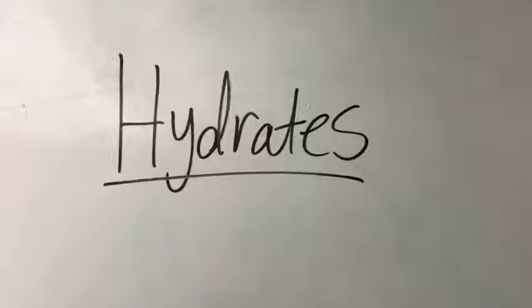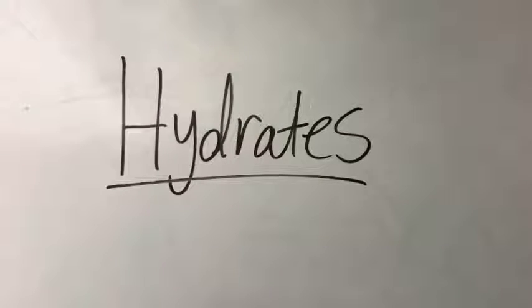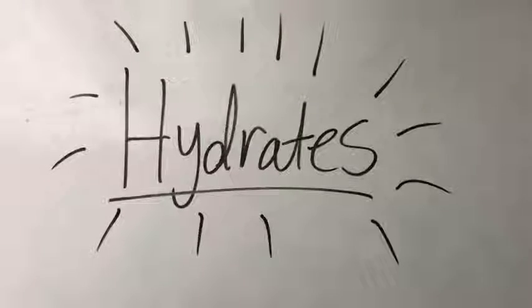Today we are talking about hydrates. We will show you how to find the hydrate formula and name compounds, as well as show you a simple experiment.